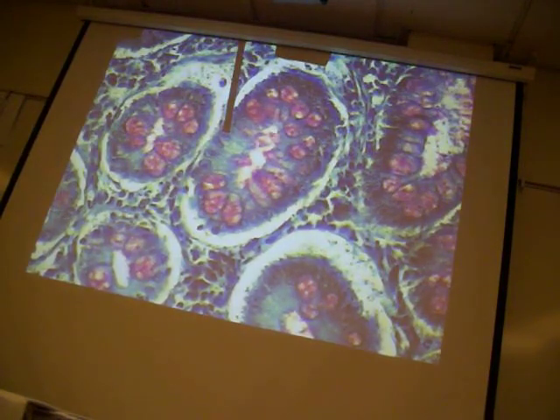And so these columnar cells, one of the big areas where you're going to find columnar cells is in your gut, in your intestines. Some of these may be ciliated, some of them may be non-ciliated. The non-ciliated ones you'll find down in your gut, your stomach, part of your gastrointestinal tract. You'll find these non-ciliated ones also in certain types of salivary glands.